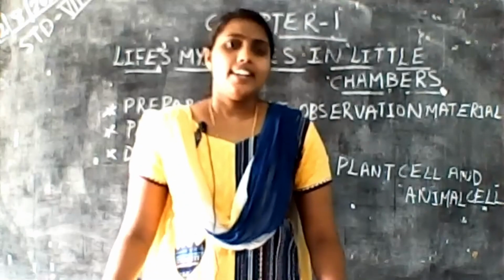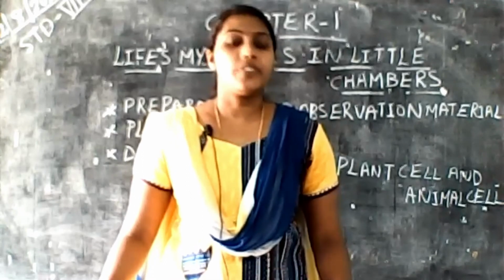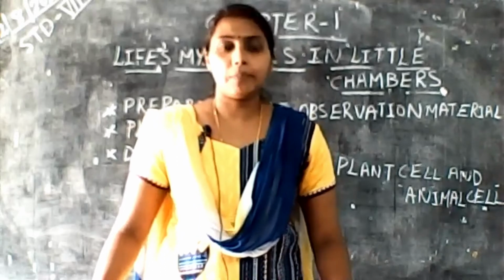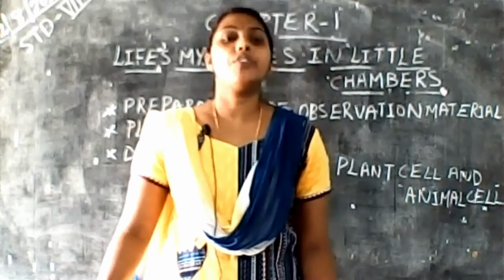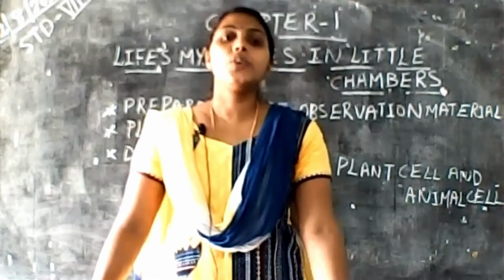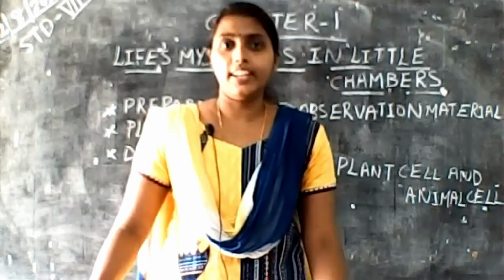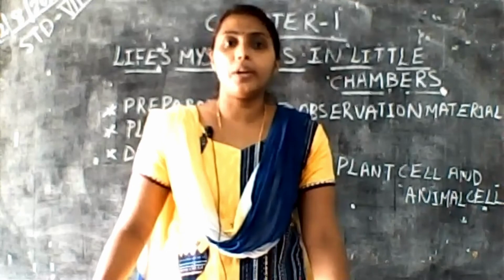Good morning. Today we are going to take the fourth part of our first chapter, Life's Mysteries in Little Chambers. This is the last part of our first chapter, and today we are going to study how to prepare an observation material to view through a microscope.